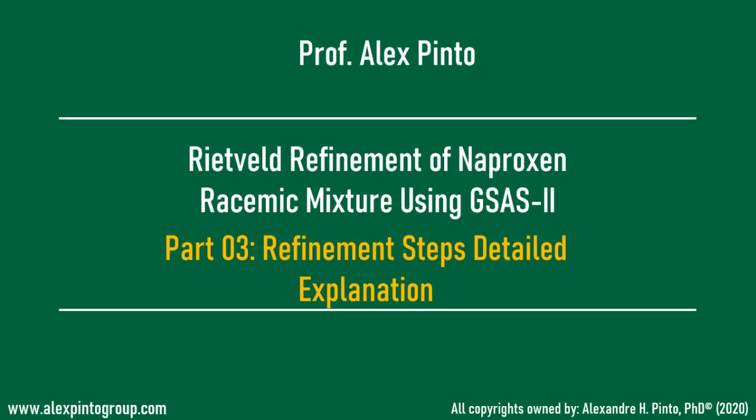Rietveld refinement of Naproxen racemic mixture using GSAS2. Part 3. Refinement steps detailed explanation.